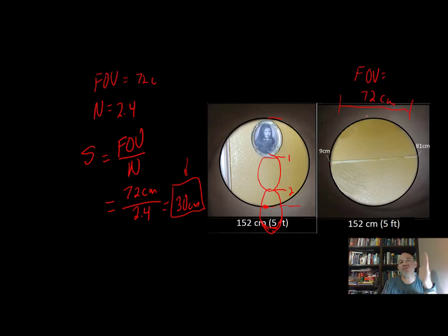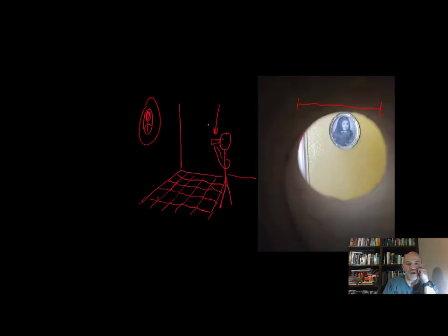But the thing is, when you change magnifications, you start off at low magnification, and then you go to higher magnifications, you're actually seeing less and less of the specimen you're looking at, or the field gets smaller, in other words. And the analogy that plays out here is if I start to walk closer to the picture, like we did up here. So if we start to walk closer and closer to the picture, the image is going to look bigger, but you're going to see less and less of the wall, right? So your field of view gets smaller.